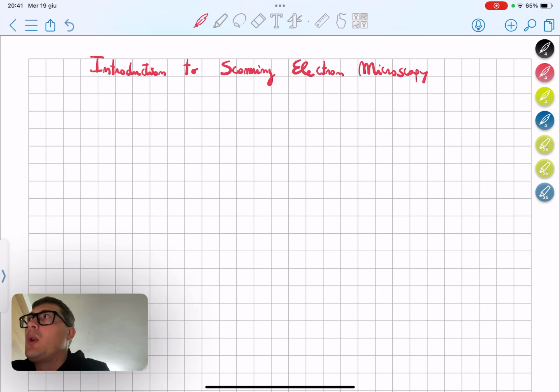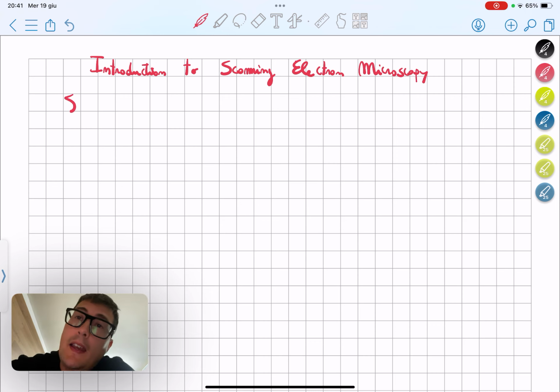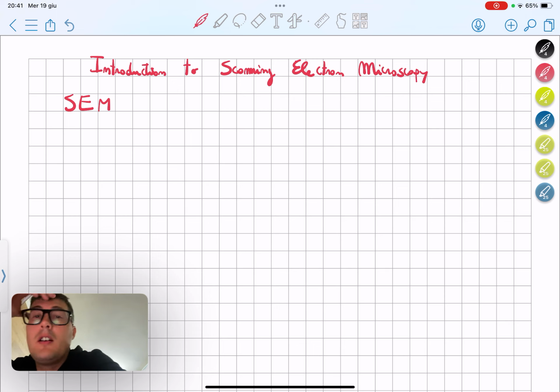Hello everybody and welcome back to another video in which I would like to speak, always at an introductory level, about scanning electron microscopy, which is SEM for short.